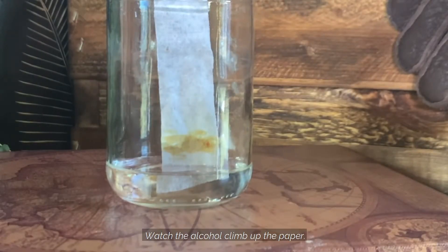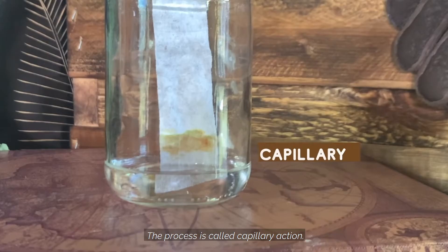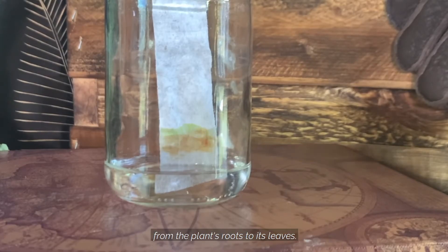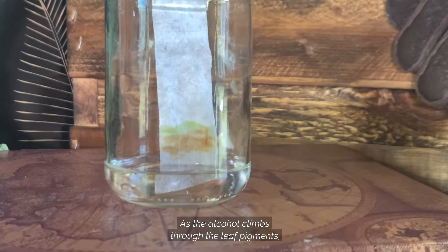Watch the alcohol climb up the paper. The process is called capillary action — it's the same way water moves from the plant's roots to its leaves. As the alcohol climbs through the leaf pigments or leaf colors, the pigments are pulled with it.